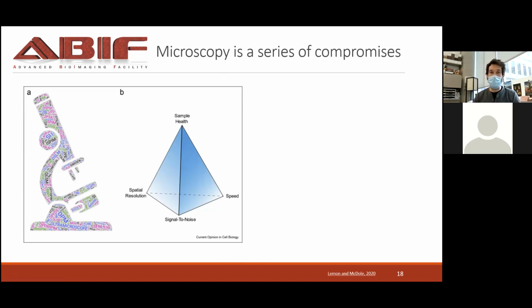So very often you'll have very different acquisition parameters to answer different questions that might all still be within the same project or the same paper. But that's it: do some fast stuff for some fast questions, do super high resolution for very intricate stuff, and do lower resolution for more global things. So you'll have really different data sets, and it makes the acquisition a lot easier if you have one question, one set of structures that you have to balance, and not try to get something that is all multiple things at the same time.